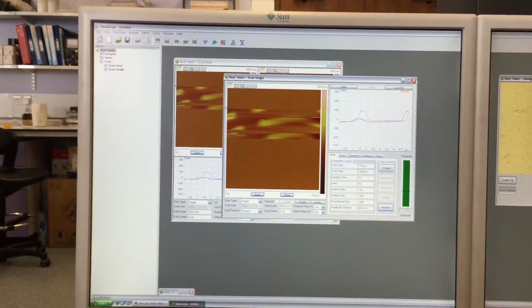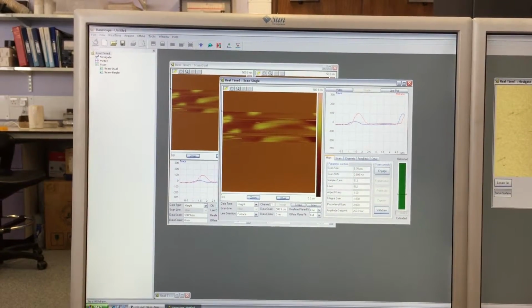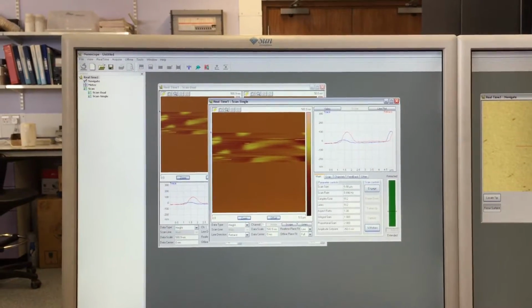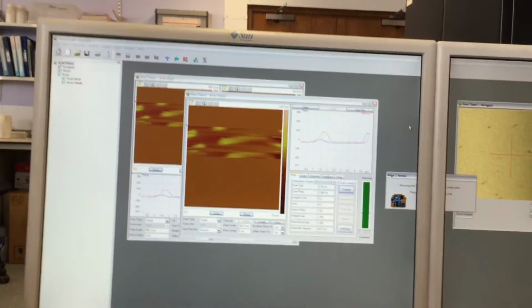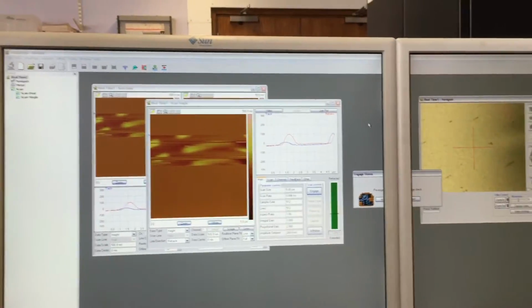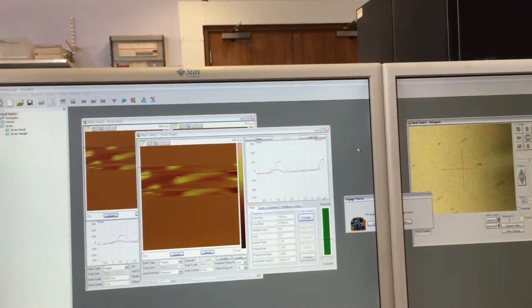That's how you could align your fibers. I'll do another area, but just look at the morphology. Just drag them into it.